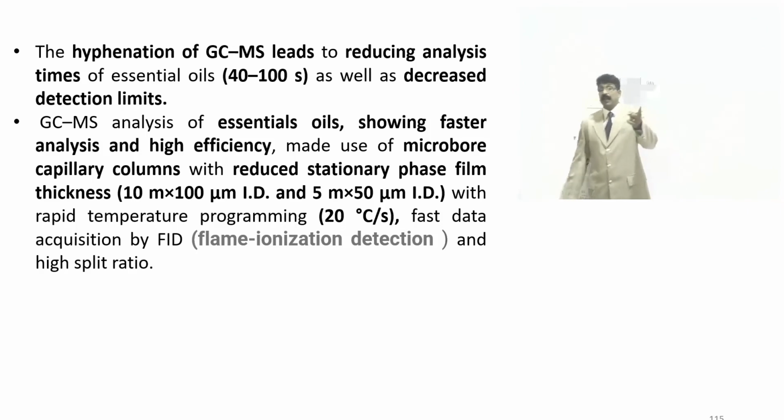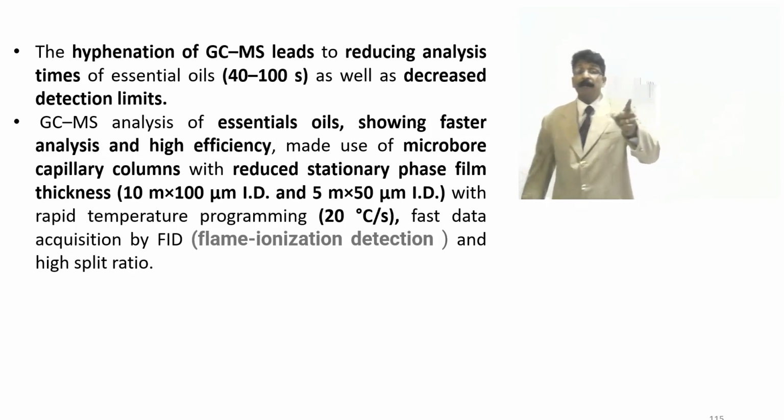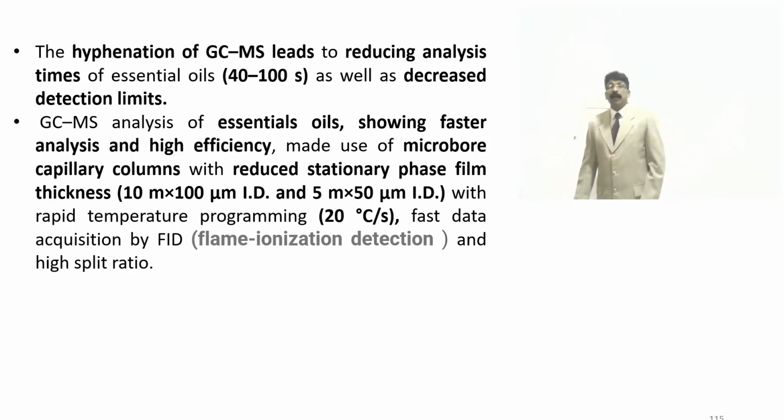A 10 meter long column with 100 micrometer internal diameter can be used, and a 5 meter long column with 50 micrometer internal diameter can also be used.